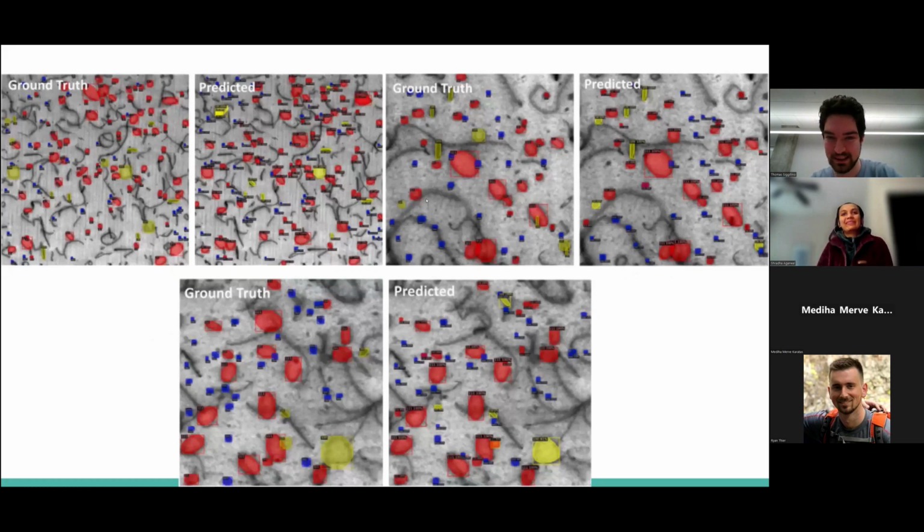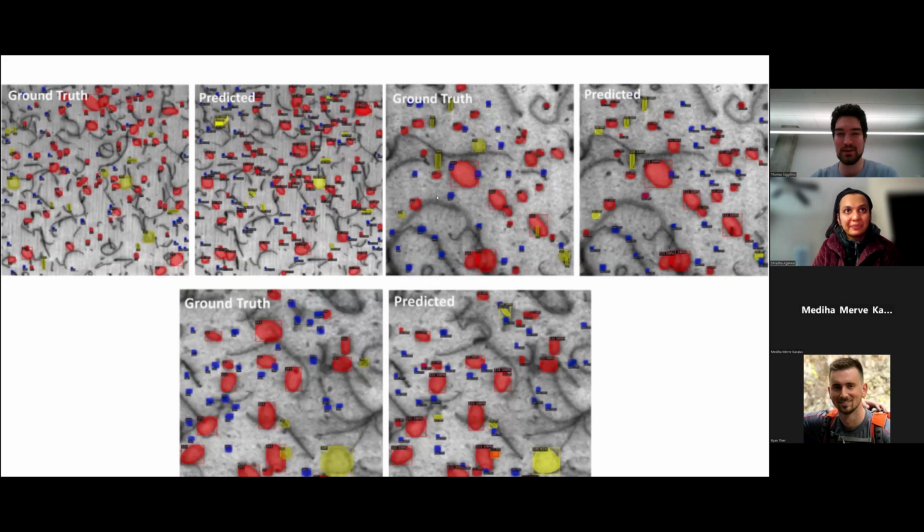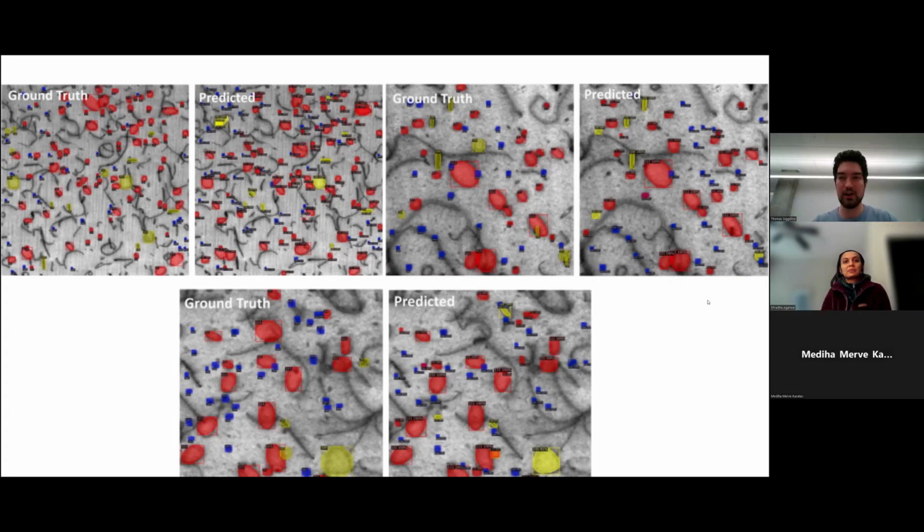For instance, in the bottom left of the right set of images, in the ground truth, there's a tiny blue dot. It's the most left blue dot compared to the right. It's red, so it's supposed to be a black spot. It classified it instead as, I believe, a 111 dislocation loop. So I think especially having the size as a determining factor for whether it's one of those loops or a black dot. I think there are some more egregious areas in here as well, but that might be hard to point out without a pointer. But overall, you can see that on the grander scale, it looks pretty good.